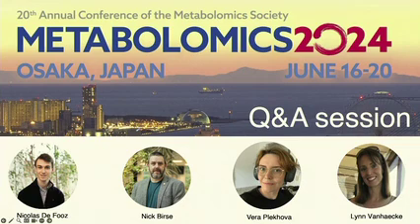It's not a common ionization source, and we do see, something that we collaborated on with Rick Dunn as well, that there's a lot of exotic, if you can put it that way, adducts and ions formed through this combination of what happens with the laser and then the IPA, the isopropanol that is working in the source. So the fact that we see those uncommon adducts probably has to do with the mechanisms behind the ionization that is caused by the combination of the laser and the IPA.